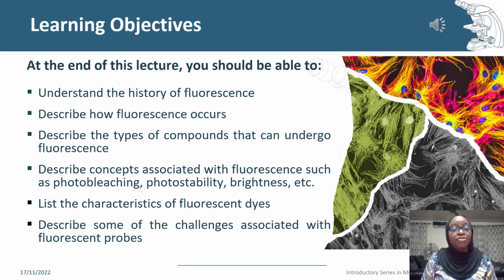At the end of this presentation, you should be able to understand the history of fluorescence, describe how fluorescence occurs, the types of compounds that undergo fluorescence, the concepts associated with fluorescence, the characteristics of fluorescent dyes, and some of the challenges associated with fluorescent probes.